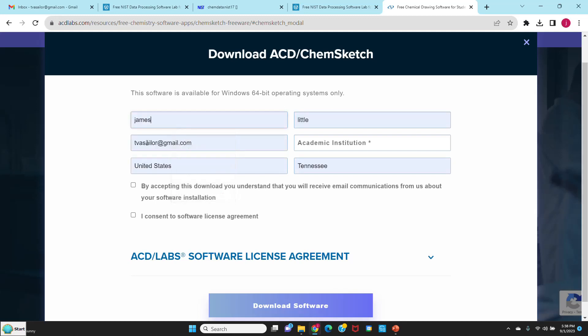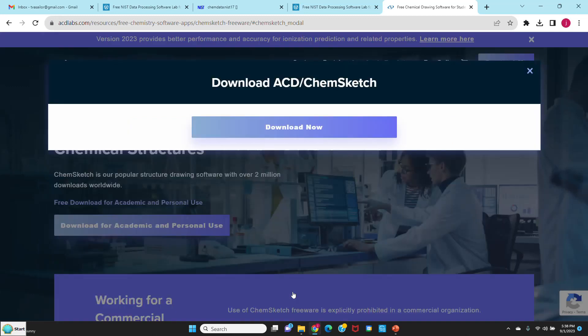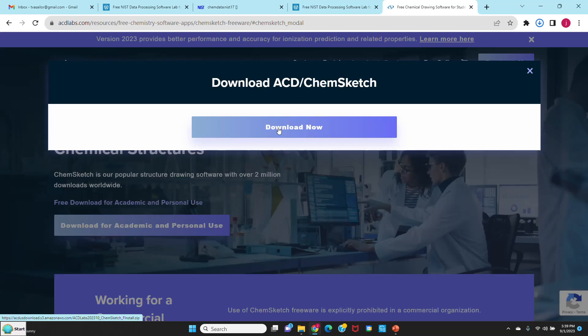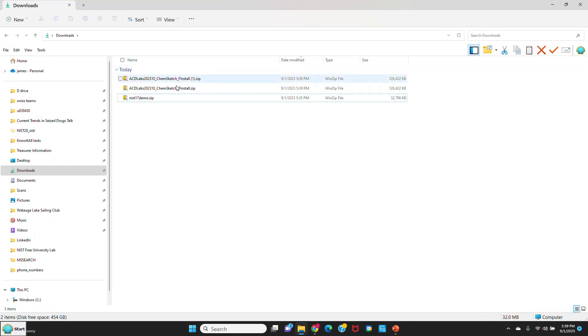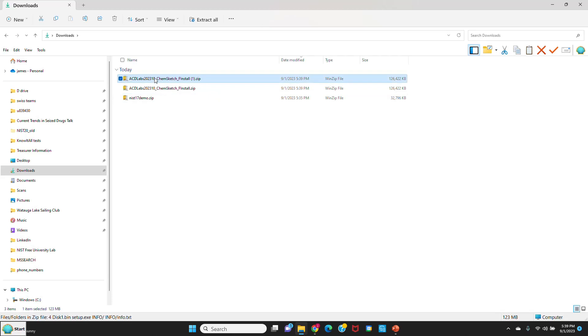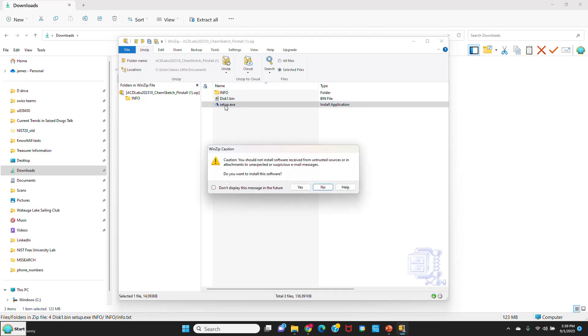I'm going to autofill mine. You have to put something for the academic institution, so I'll just put teaching aid. You can put your university and say I accept all the criteria, and say download the software. Download now. It's downloading to my download folder on my computer. Let's go to my download folder and see if we can find it. I actually downloaded it twice while I was doing it. So I'm going to double left click on the ACD icon.